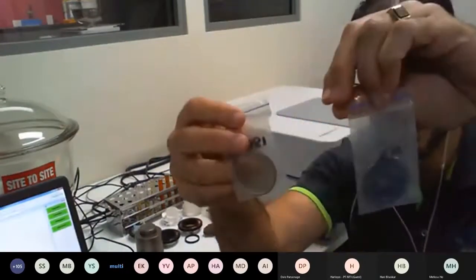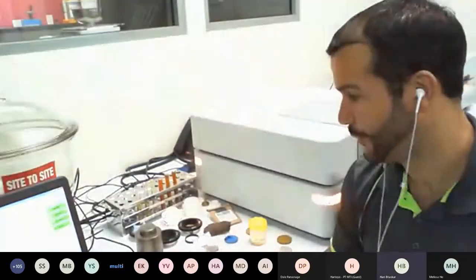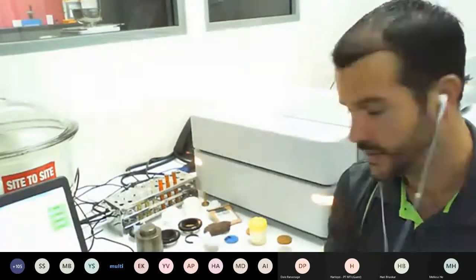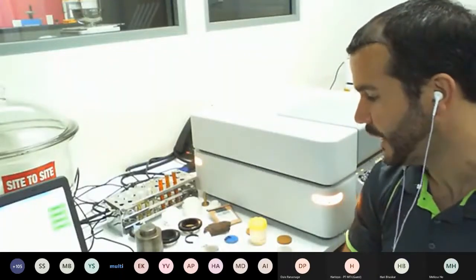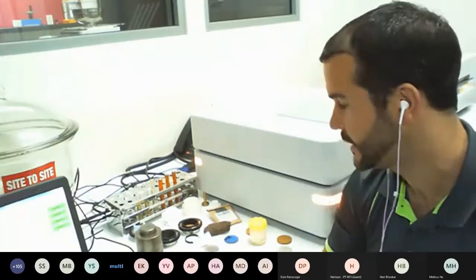Got some nice examples of some lovely coloured fused beads there. And as we step through these different sample types, we actually improve our precision and accuracy of measurement, and that's to do with several factors that include the flatness of the surface and the sample homogeneity. And then as you move into fused beads, you start to remove things such as mineralogical effects.